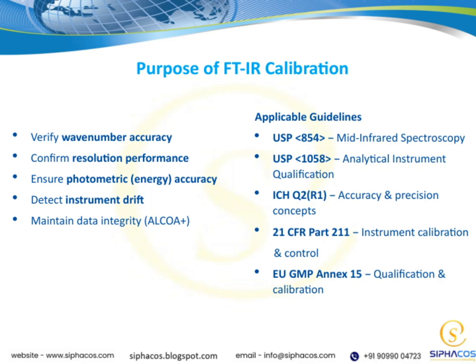Lastly, proper calibration plays a key role in maintaining data integrity, aligning with the ALCOA Plus principles: attributable, legible, contemporaneous, original, accurate, plus the additional qualities of complete, consistent, enduring, and available. All these points connect to our broader goal of ensuring accurate, reliable, and compliant analytical results.